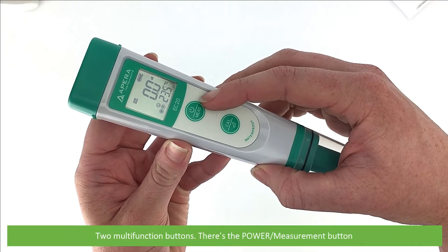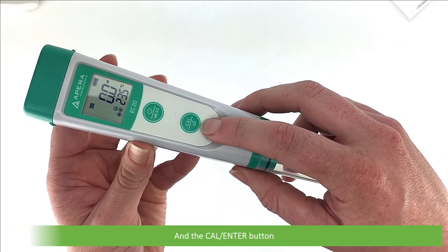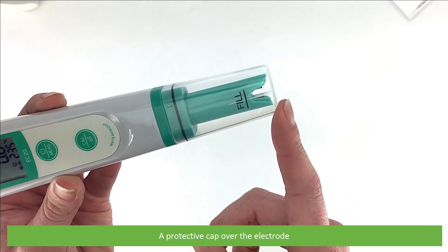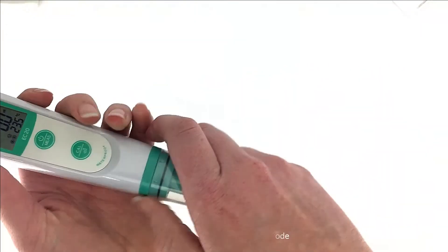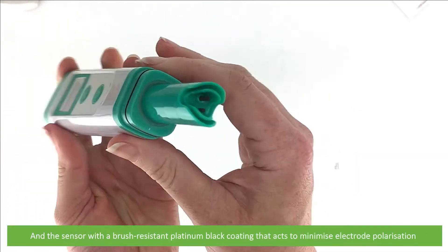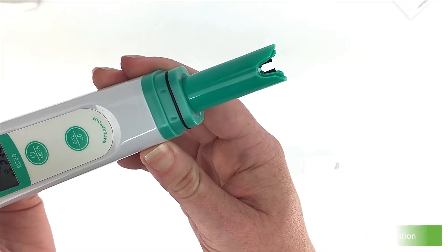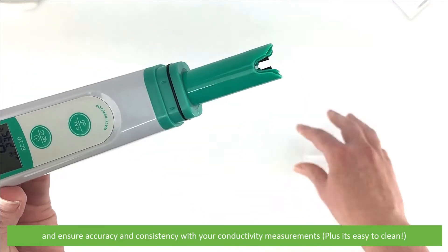There are two multi-function buttons: the power measurement button and the calibration enter button. There's also a protective cap over the electrode, and the sensor with a brush resistant platinum black coating that acts to minimise electrode polarisation and ensure accuracy and consistency with your conductivity measurements.